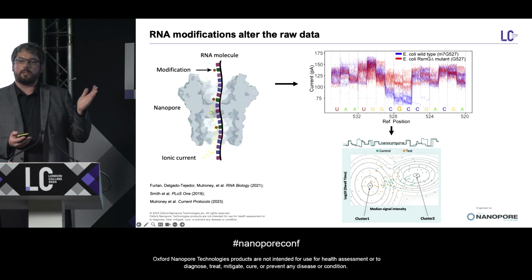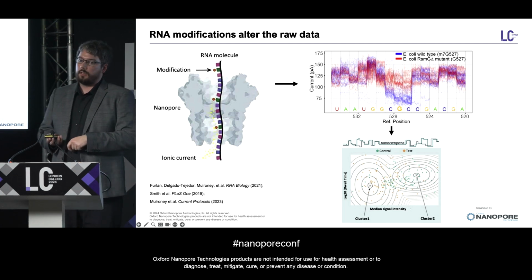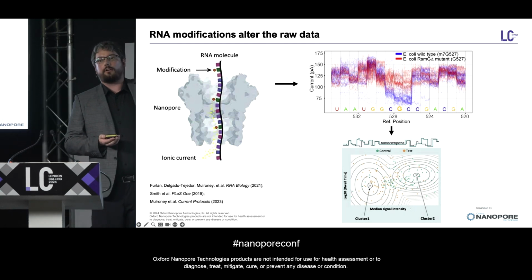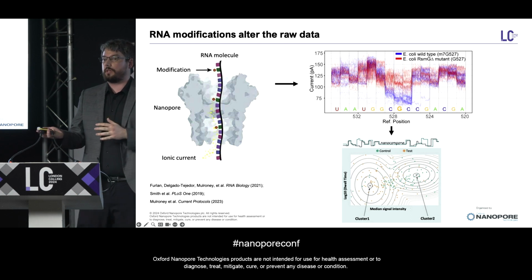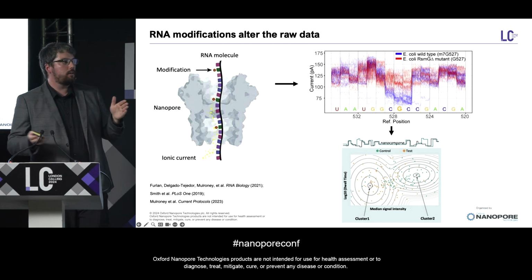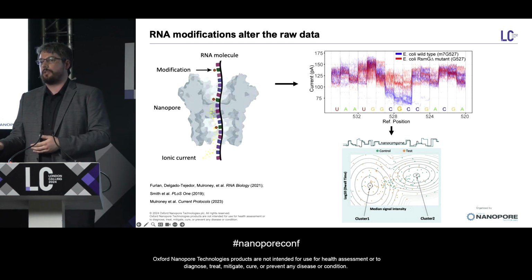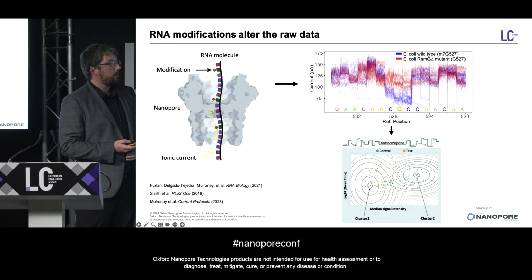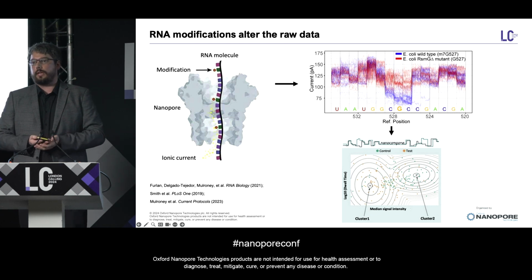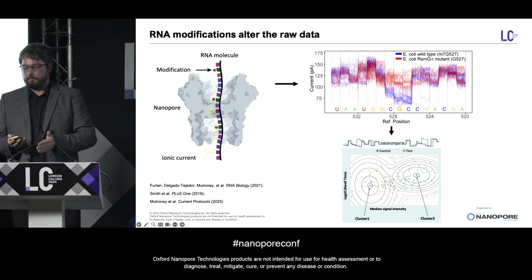And so with nanopore sequencing, with direct RNA, the modifications are kept intact because we don't go to cDNA. And so these modifications, as they pass through the nanopore sensor, cause ionic current changes in the signal that are different from the canonical nucleotide. And so we can detect these differences in the ionic current using software packages like Nanocompore, which was written as part of my group by a previous postdoc, Adrian Leger, who is sitting in the audience now. And so this software compares these two samples using a Gaussian mixture model, and then clusters the data to find the positions where there are significant differences.